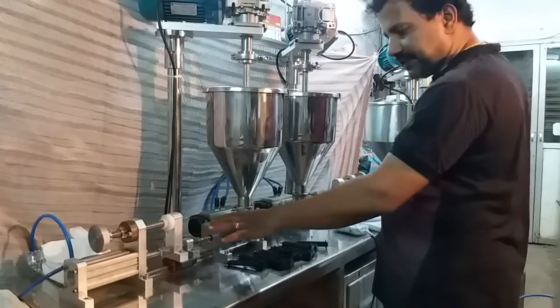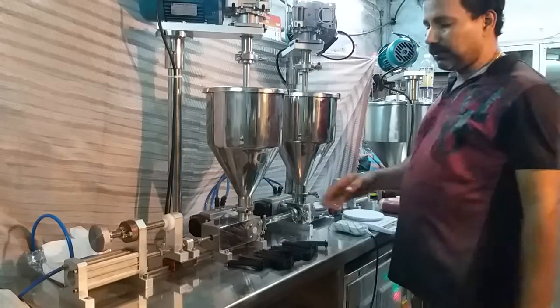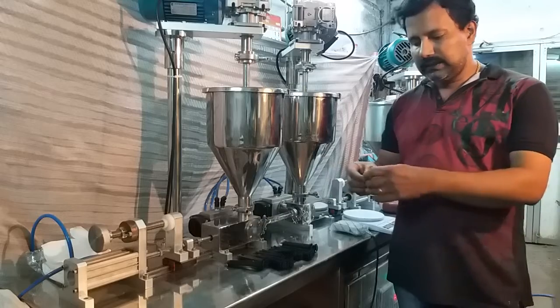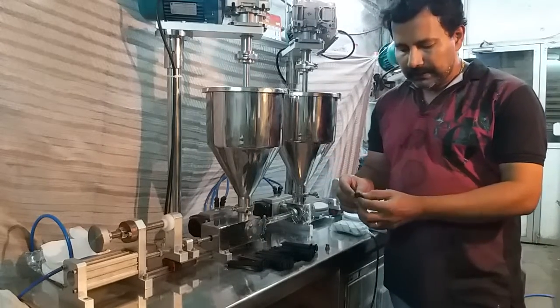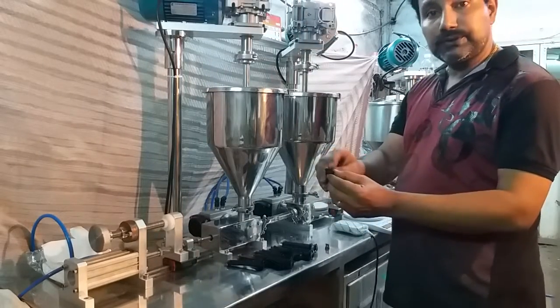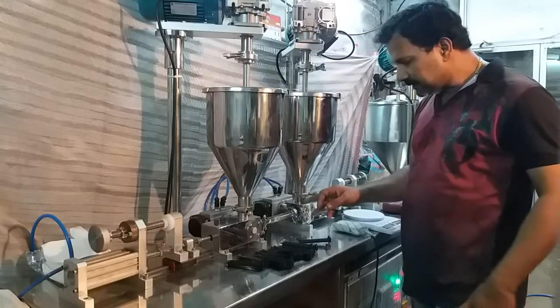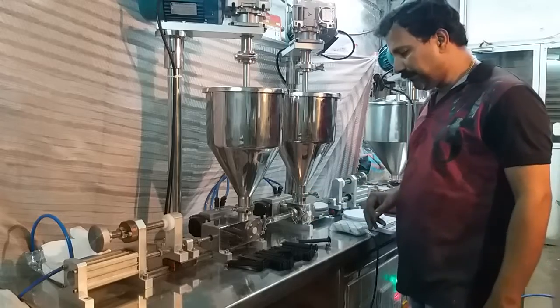I have set the machine to fill 3 cc or grams from each head. This is a special kind of nozzle we have developed for this type of cartridge filling. This cartridge has two nozzles very near to each other, so we had to design a special type of nozzle. We can also design special nozzles so that you can fill other types of cartridges.